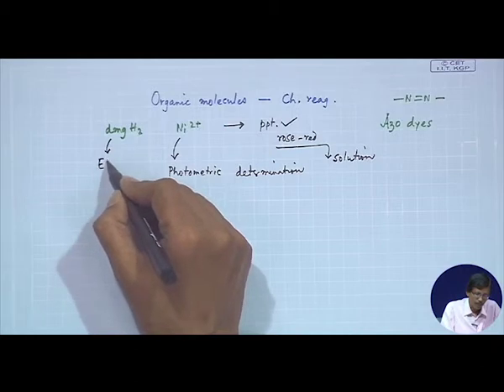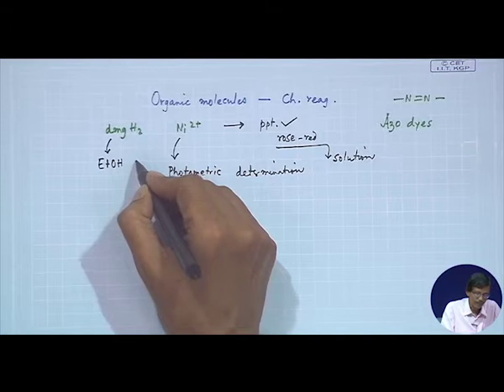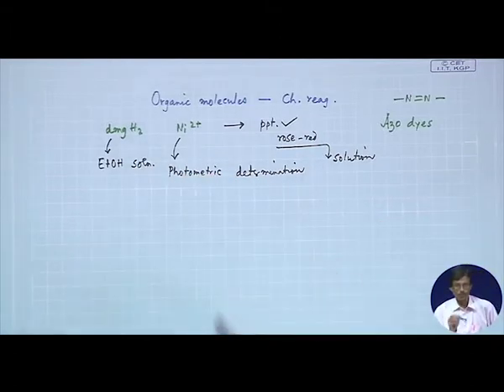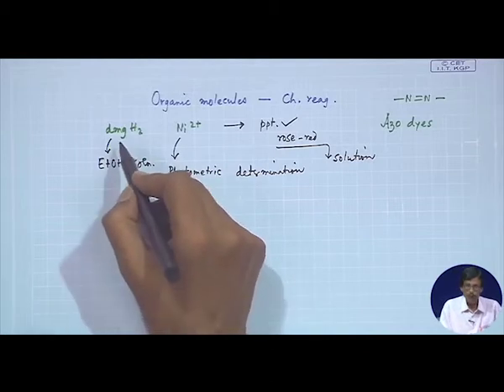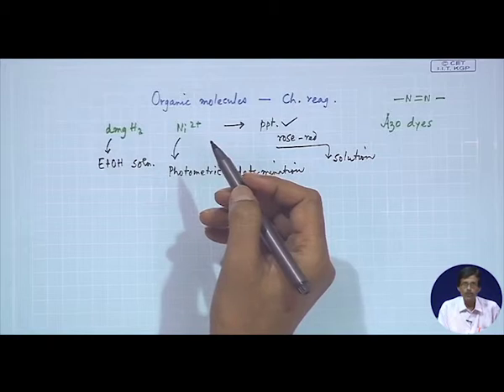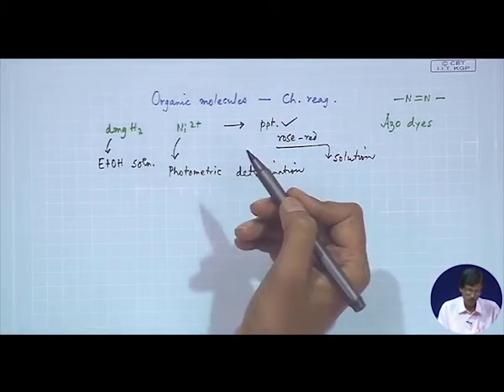In the laboratory we get this as an available solution in dilute ethanolic solution, because initially we dissolve the solid powder, a white powder compound, in ethanol and then dilute with some amount of water. Sometimes it can be 1:4 or 1:5 or even 1:10.